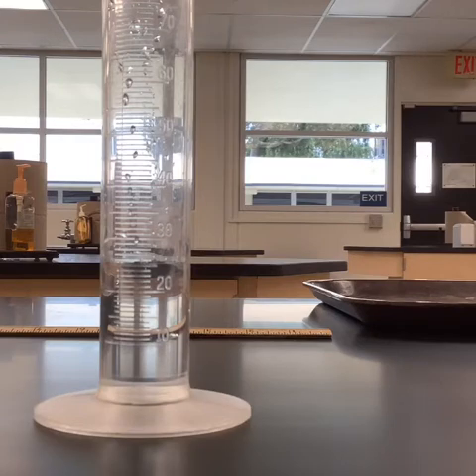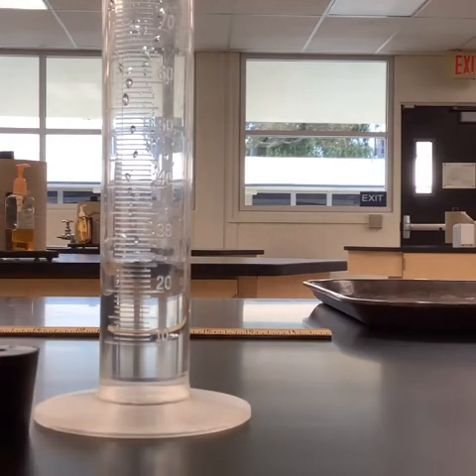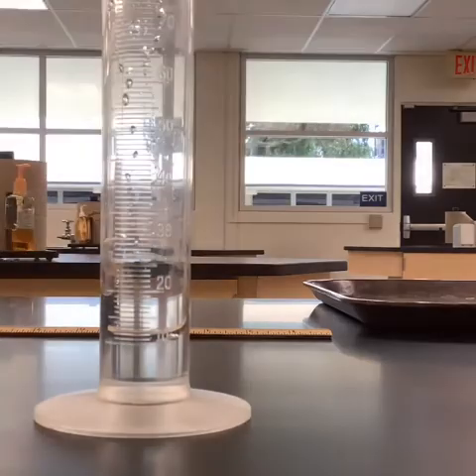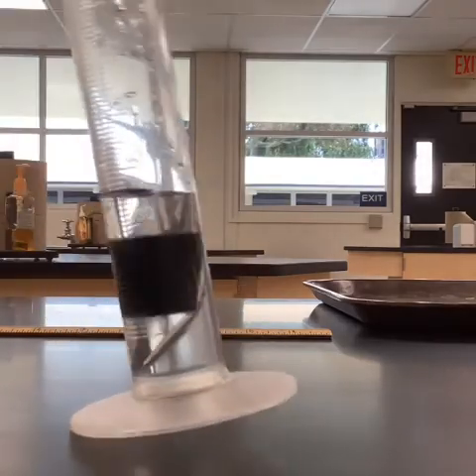This is what we call the initial volume in the graduated cylinder. And now what we want to do is take that irregular object, so we've got that rubber stopper, and we're going to go ahead and drop it into the graduated cylinder, and we're going to see how the volume changes. So we're going to gently drop it in. I don't want it to go too fast so that it splashes everywhere.